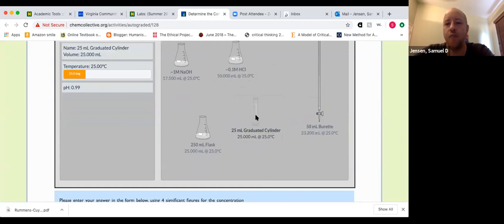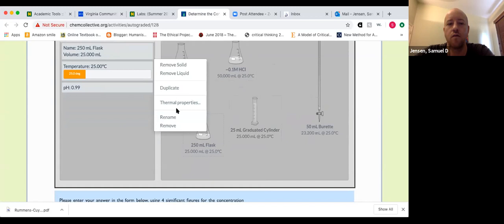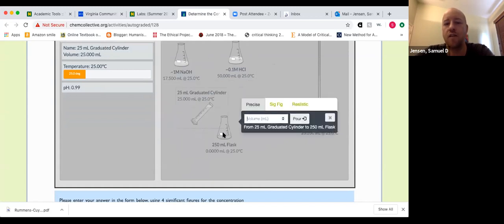And then that sample is what you would put in here, because this flask doesn't measure 25 milliliters. There's no realistic way that you would get 25 milliliters in here. The flasks are not meant to measure volume. Their graduations are very imprecise. Again, the simulator makes this a little easier because it's a computer and it'll do what you tell it to do.